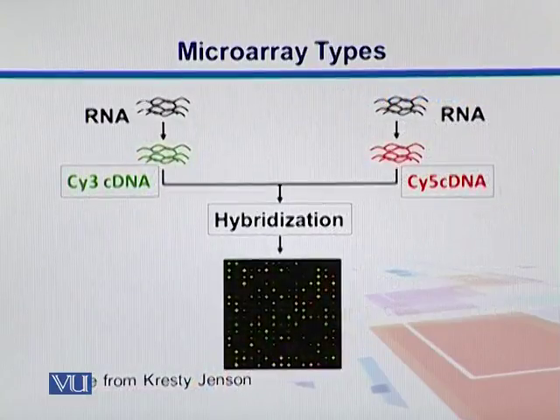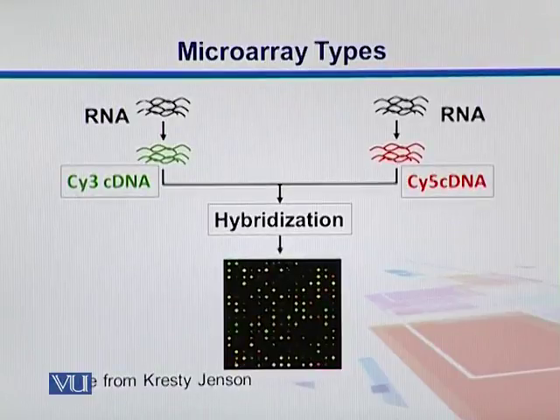So we take, for example, here again we repeat this example. We have seen that earlier also. We have RNA type 1 and RNA type 2. We take RNA type 1 labeled with Cy3, which is a dye, and then we have Cy5, which is another dye that is colored red. We take these two RNAs and let them hybridize to the probes present on the slide. These two types of RNAs may be coming from two different tissues, or from the same tissue, where one has some treatment and the other is a control. We put them together on that slide where we have a lawn of probes.